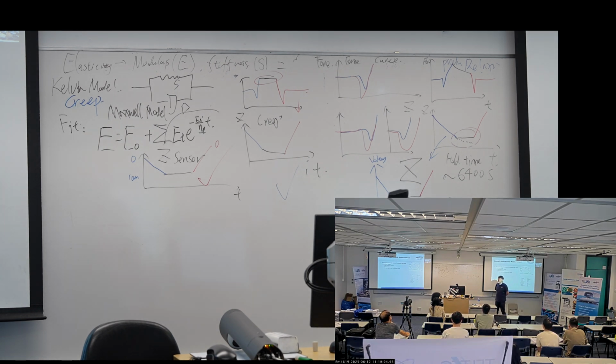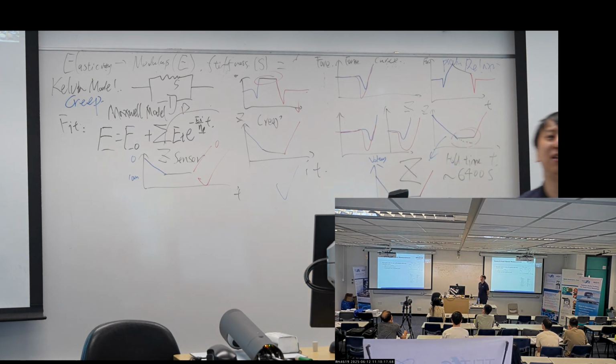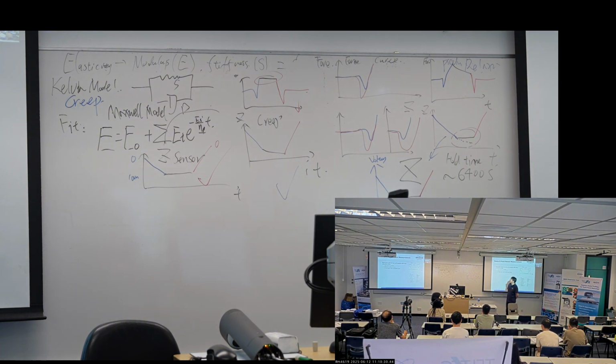They would say, no, this is not relaxation. But luckily, nowadays for creep and relaxation we all use the Maxwell model to fit it, so it's okay. But the AFM community still provides relaxation and calls it relaxation, but we think this is not true relaxation. The creep is real, the relaxation is pseudo.